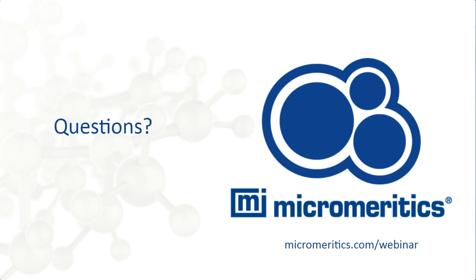I think what you probably have seen with the examples that I used is that it's not always straightforward to find the right range, and it depends on the materials. It depends on the quality of the isotherm, and there are different influences on the quality of the isotherm. As I mentioned, what I really like is the auto BET fit, because it kind of does the work for you. It helps you to find out for this material, for this set of data points, what is the right range so that I can make sure that the criteria that I mentioned are fulfilled and met in a perfect way. So I would use that as the answer to those 3 questions. It makes a lot of things just as easy as possible for you.